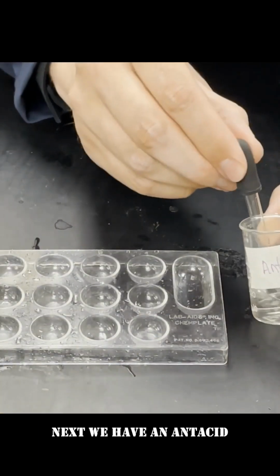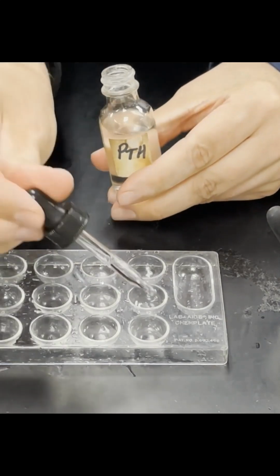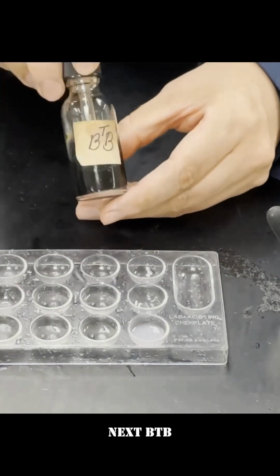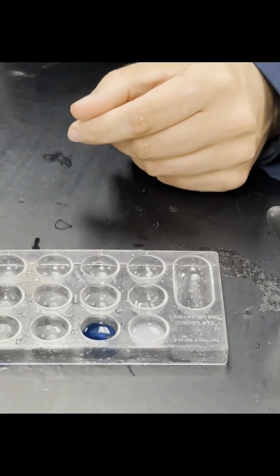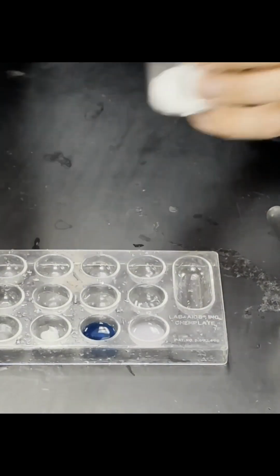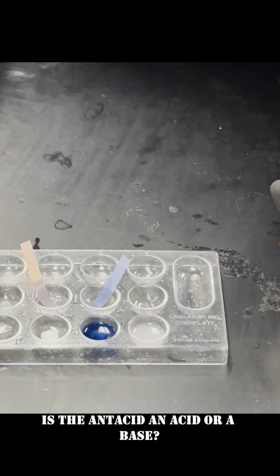Next we have an antacid. First, phenolphthalein. Next, bromothymol blue. Carbonate. And litmus paper. So is an antacid an acid or a base?